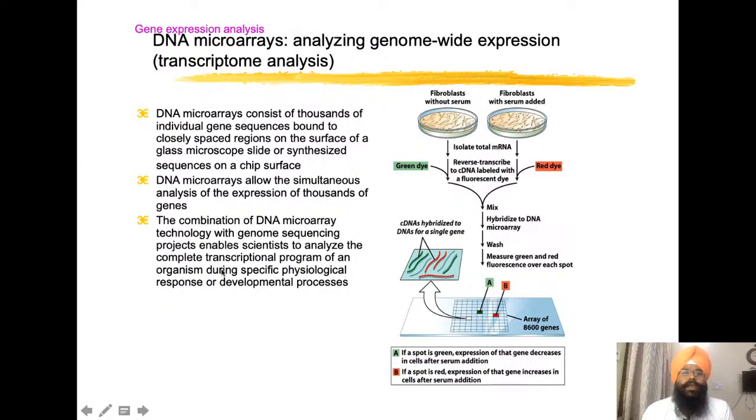Now comes the DNA microarray technique, which helps to analyze genome-wide expression. The DNA microarray technique consists of thousands of individual gene sequences bound to closely spaced regions on the surface of a glass microscope slide, or synthesized sequences on a chip surface. DNA microarrays allow the simultaneous analysis of expression of thousands of genes.